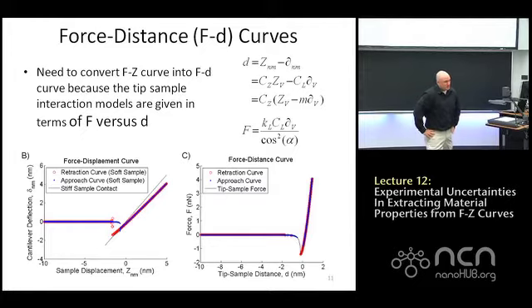But that issue will come. Geometry comes in later. The tip geometry is more included in the model. So if we consider measuring indentation as the apex of the tip indenting into the sample, and we have the laser spot directly over the apex of the tip, this is fine. But one can imagine a situation where this could become more complicated. If you have a funny shaped tip, maybe your tip is not a hemisphere, but for some reason it's a double tip with two separated hemispheres.